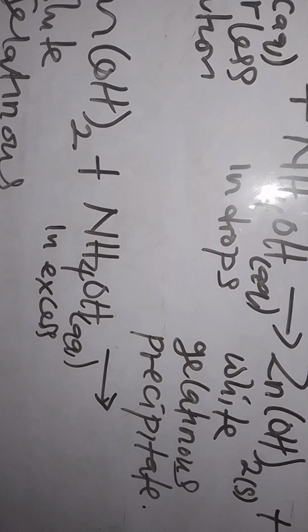You now add NH4OH in excess. What you are going to have is another complex salt, which is tetraamine zinc 2 ion.